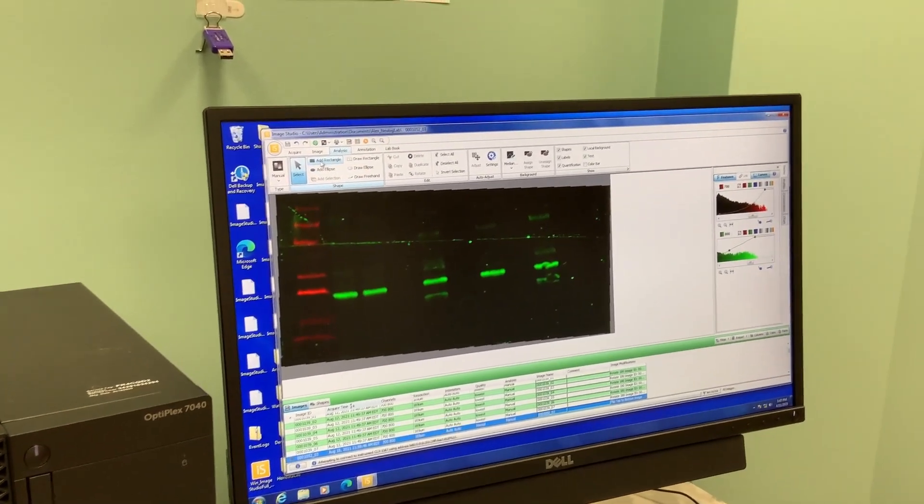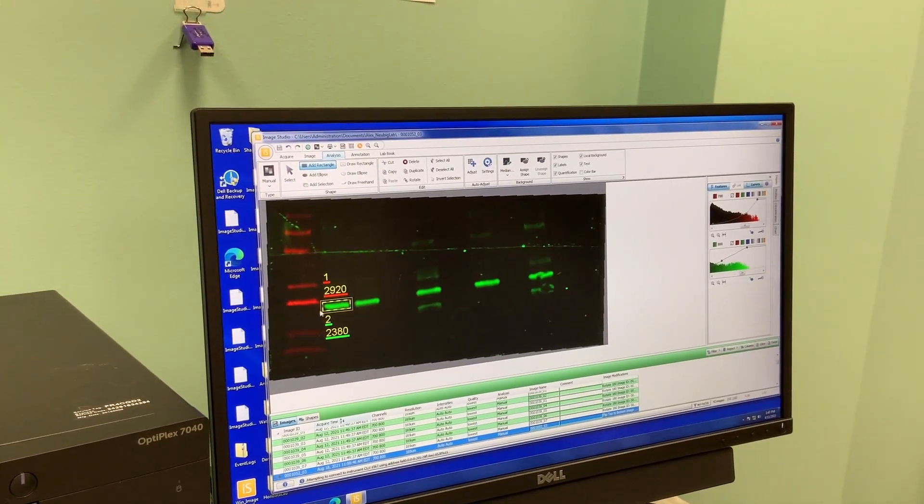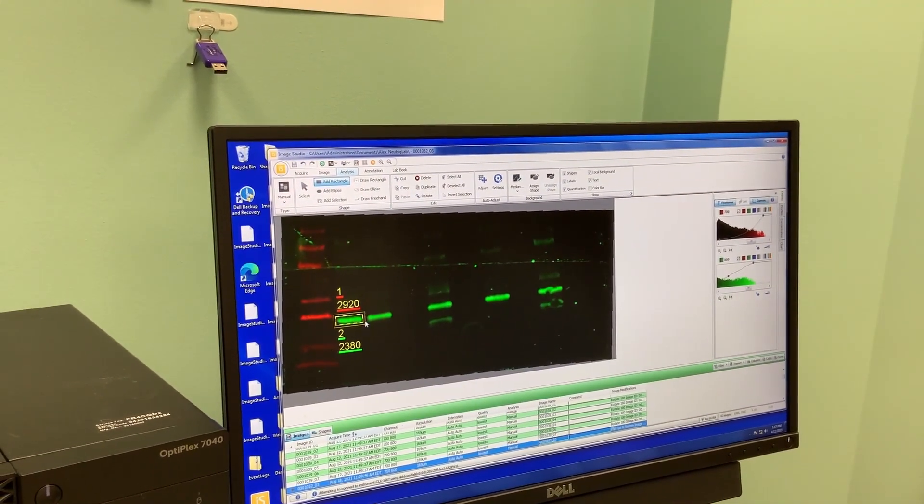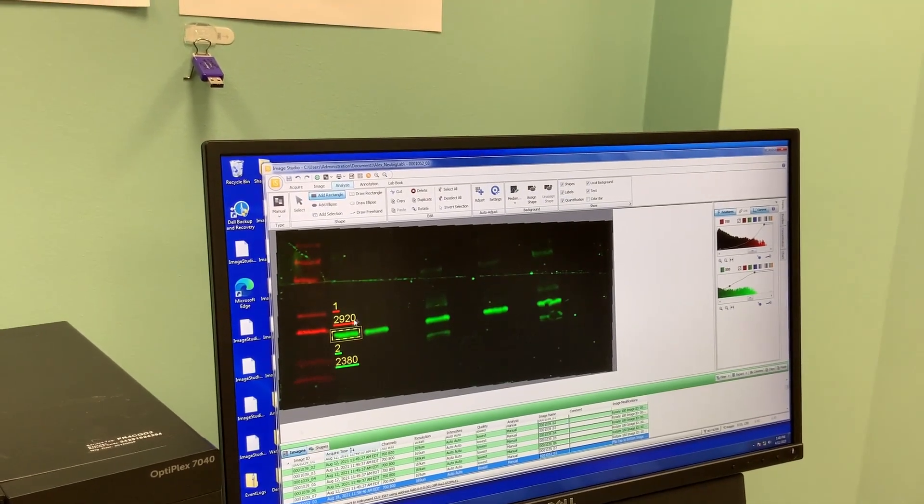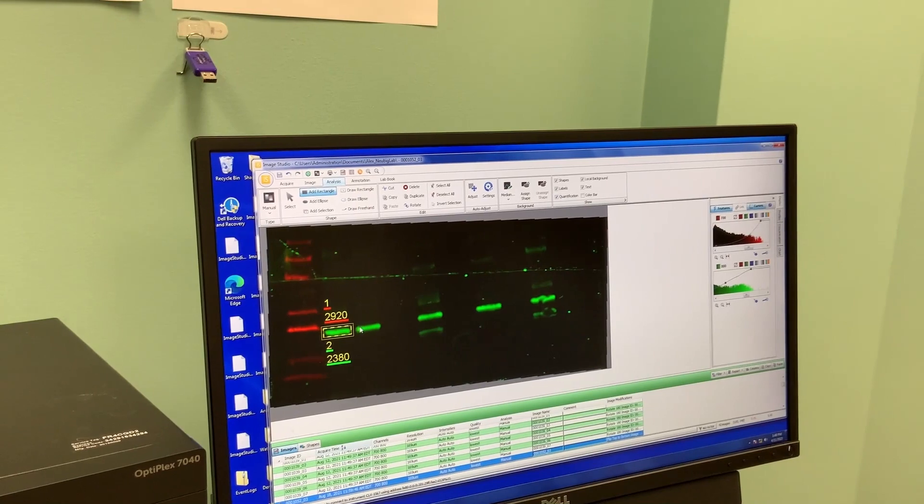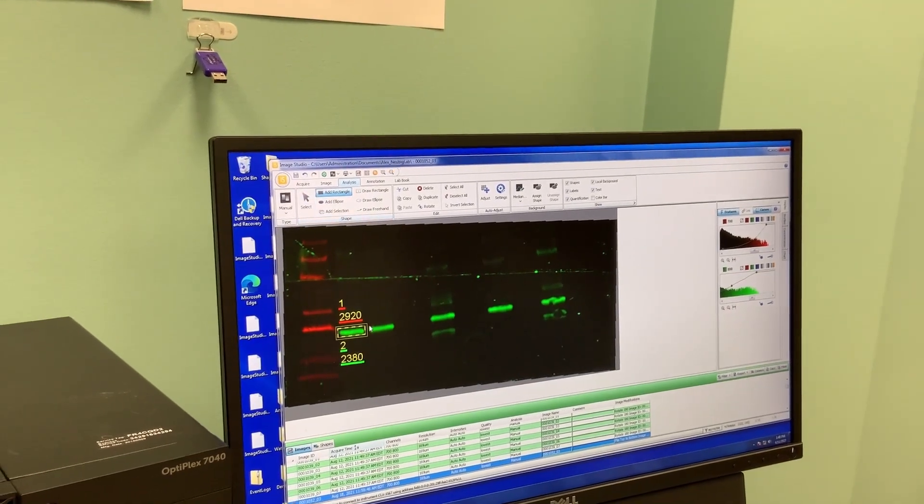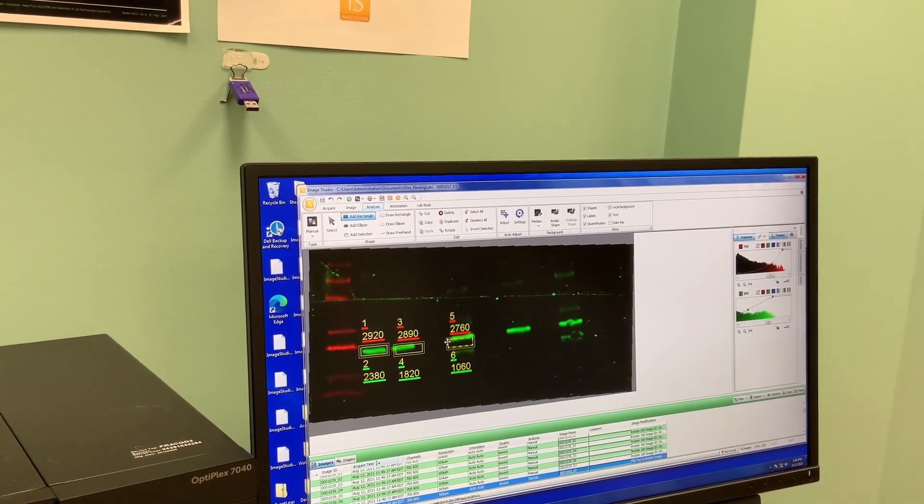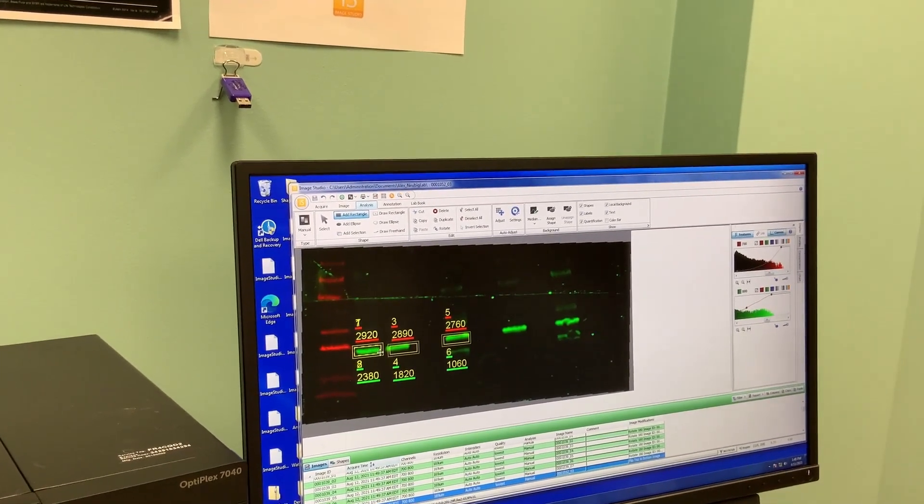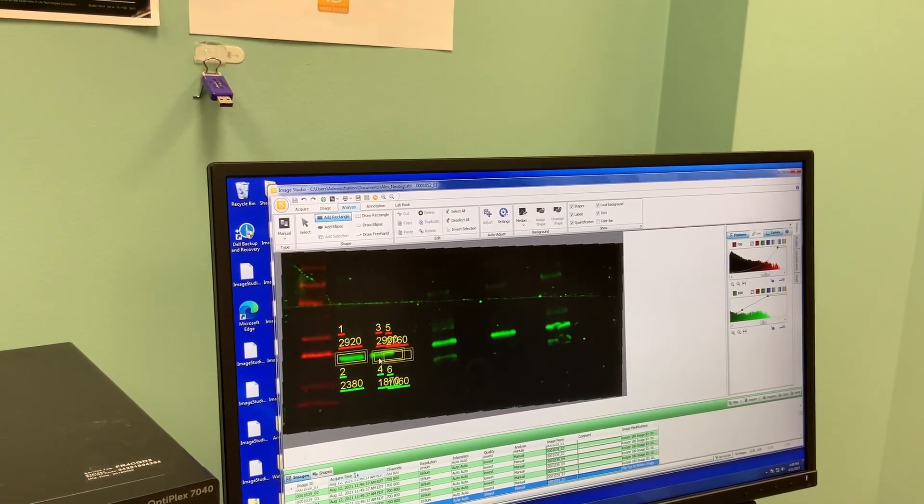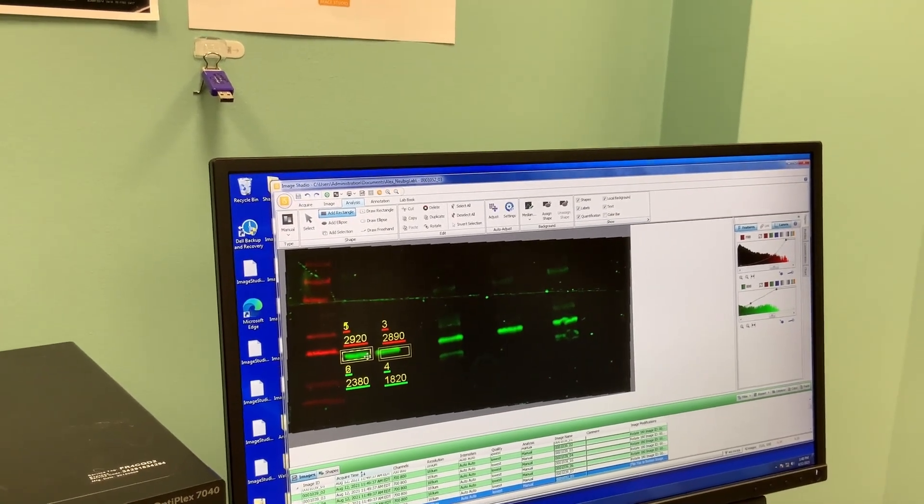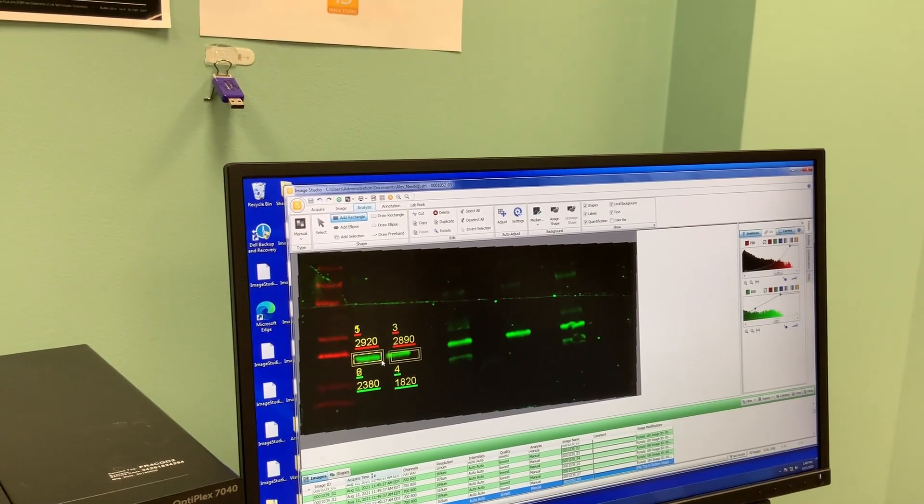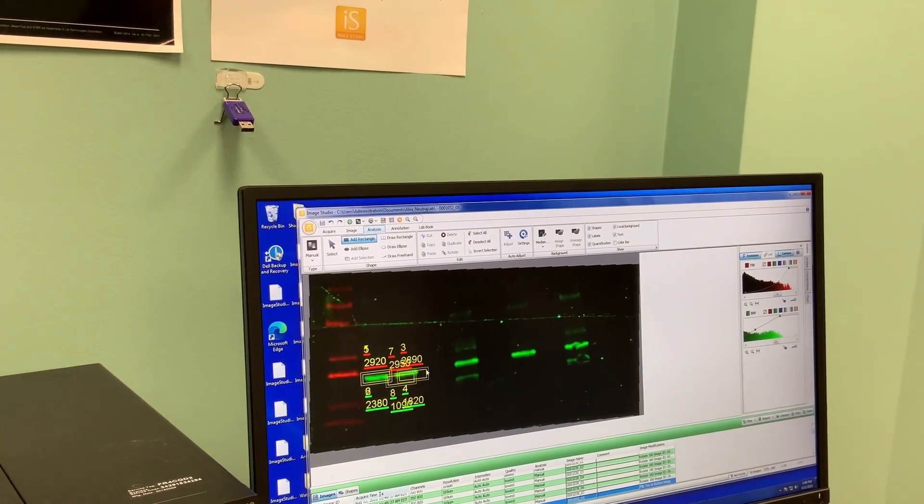There's this analysis tool where you could, for example, add rectangles. You can draw a rectangle around the regions and then it will quantify the brightness of that region. Once you add them, they come in at a default size and then you're able to change the size of these rectangles to fit your band.